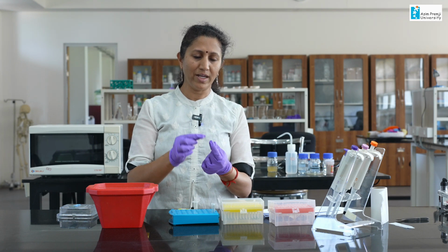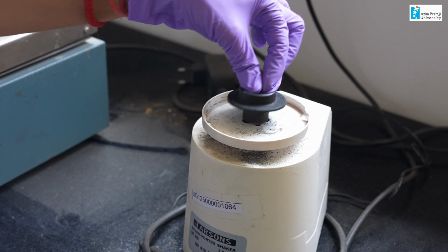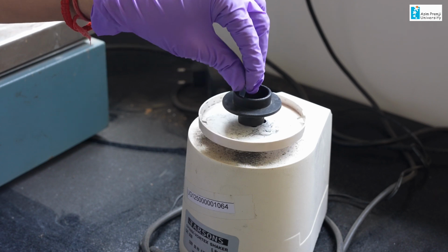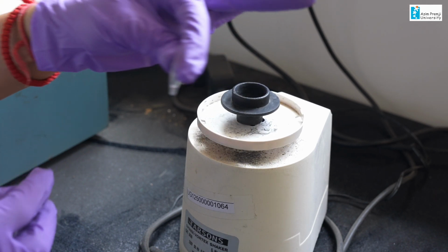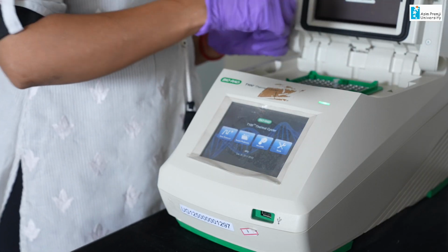Once this is ready, we have to keep it in the PCR machine. Before keeping it in the PCR machine, I am going to mix it, and as I mentioned, mixing or vortexing is an important process. So, I spin my material, and now I am going to keep it inside the PCR machine.